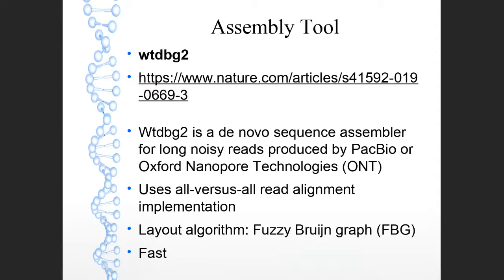And it does this by making alignments of our reads, or alignments of chunks of our reads, before making its De Bruijn graph. This allows us to compensate by that alignment for the errors that we encounter. And it's actually relatively fast compared to other long read assemblers.